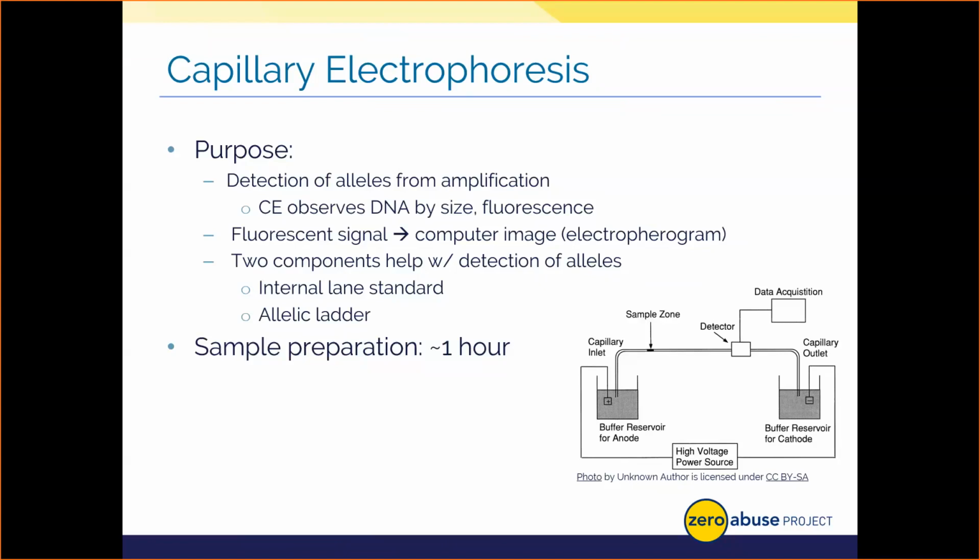An allelic ladder then is a series of known DNA pieces of a given size representing all the possible alleles for a locus being tested by our kit. Because the components of the allelic ladder and the sample fragments have the same length and the same sequence, they're going to migrate at the same distance and the same time in the CE. Thus, we use the allelic ladder to determine what alleles are present in your sample by comparing them to the known alleles from the ladder.